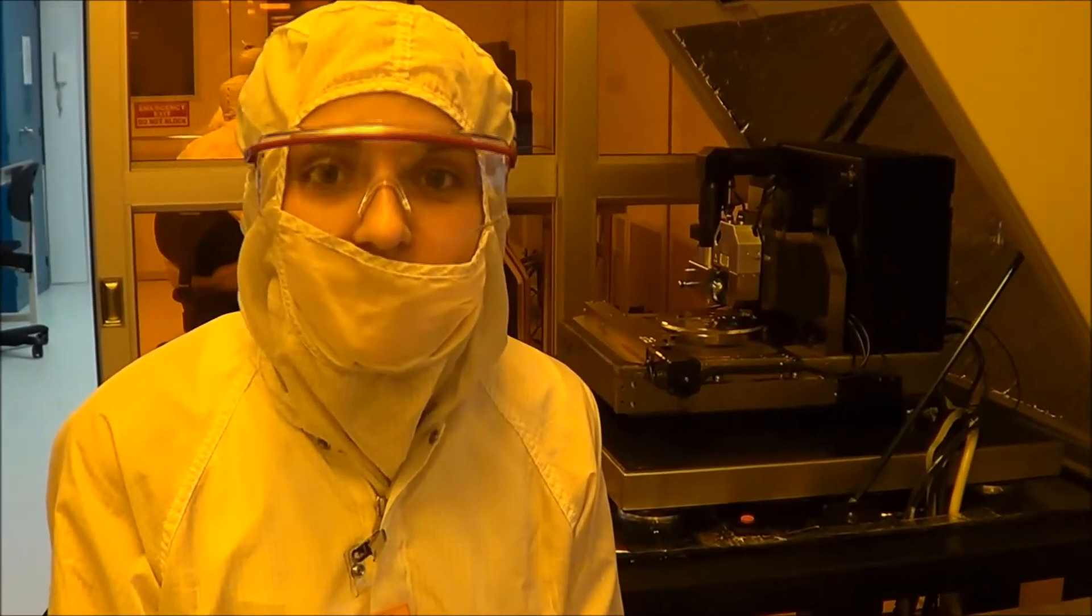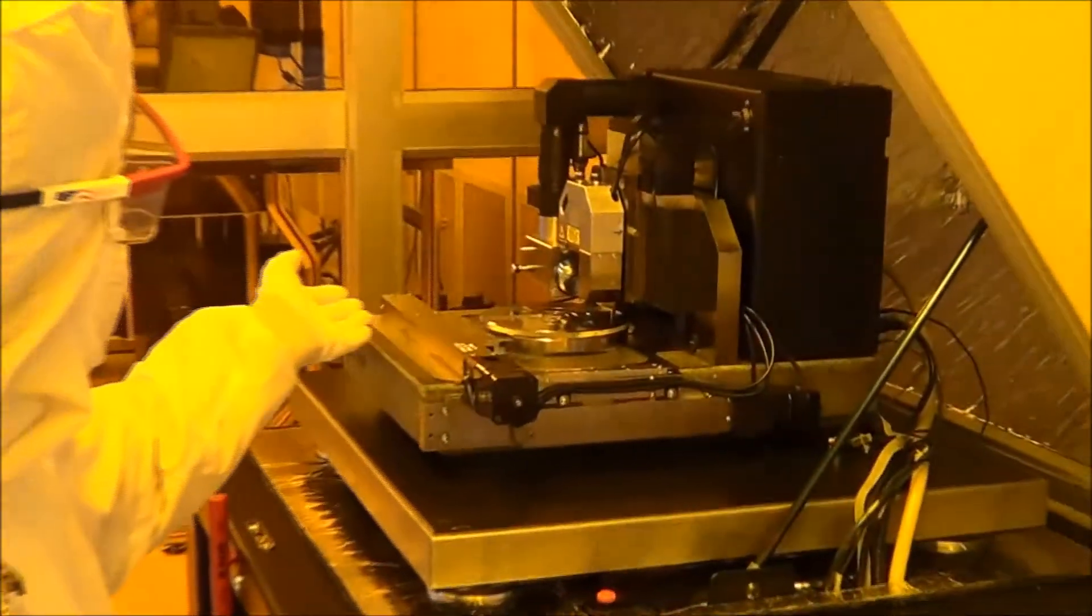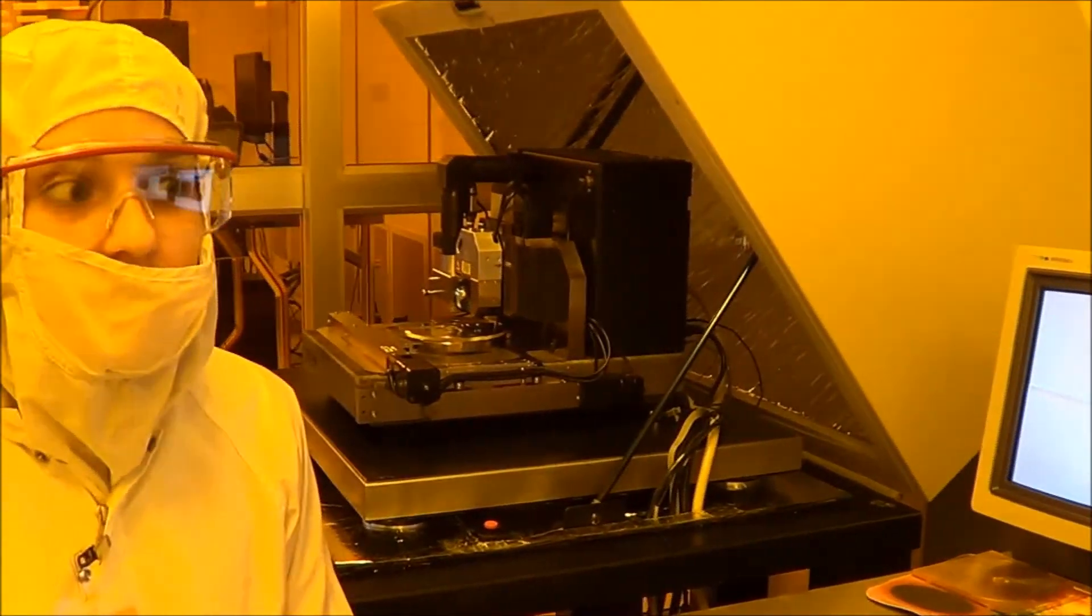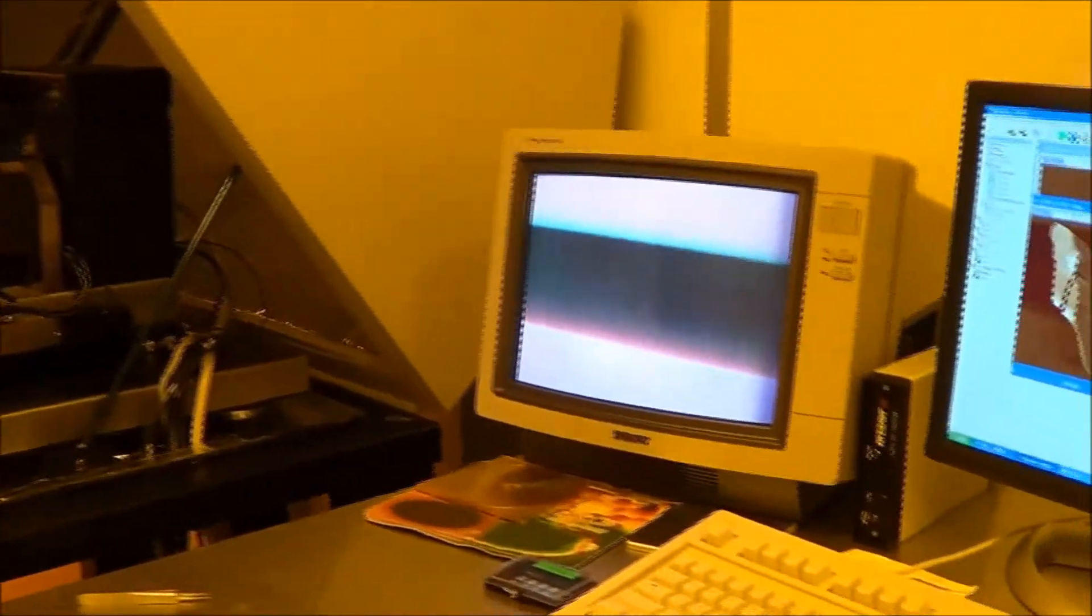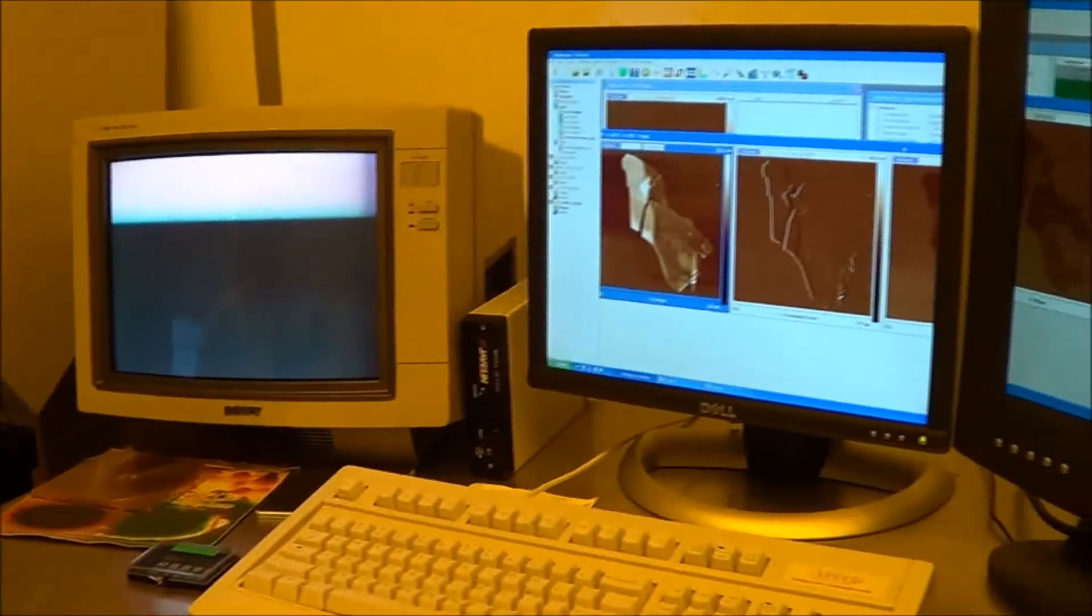The next step in characterizing our flake is using the atomic force microscope. After you've uploaded your sample, the machine will use a very sharp tip to move over the flake and determine vertical thickness. This vertical thickness is very helpful in order to understand whether or not we have exfoliated to monolayer.